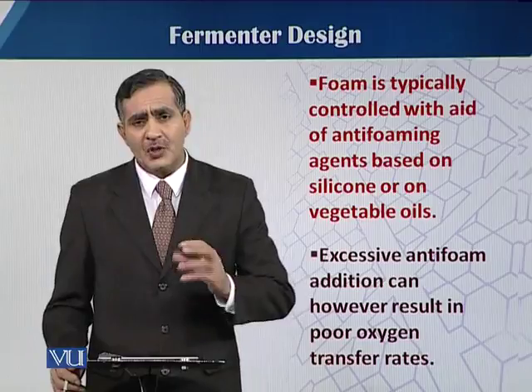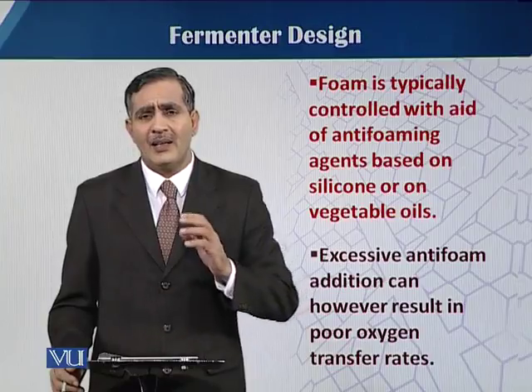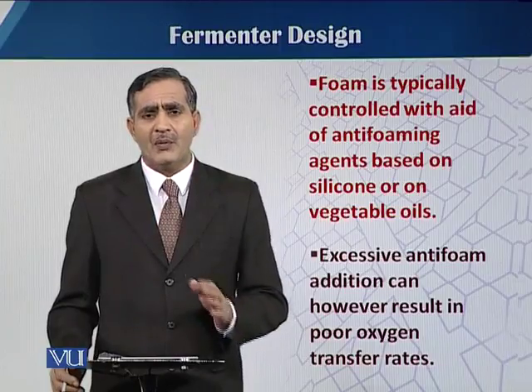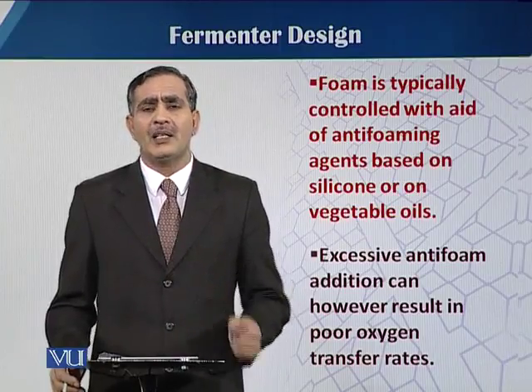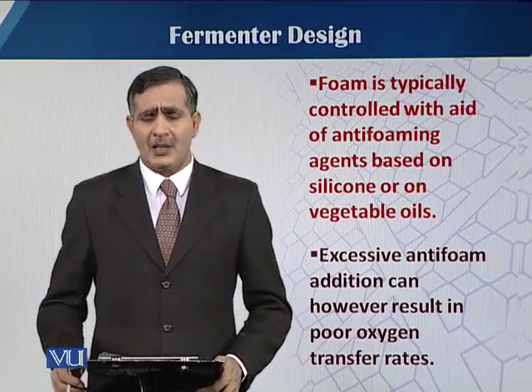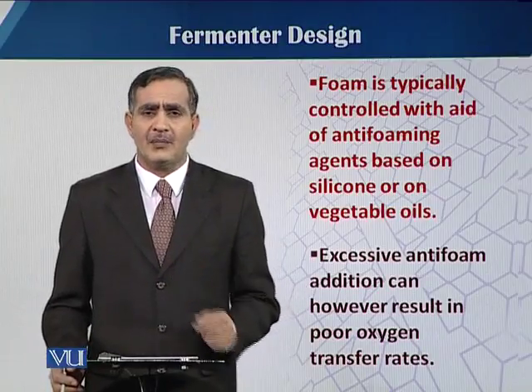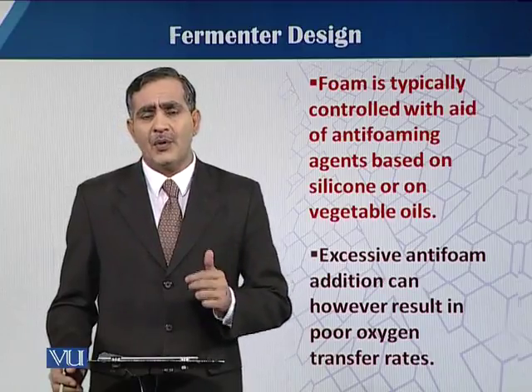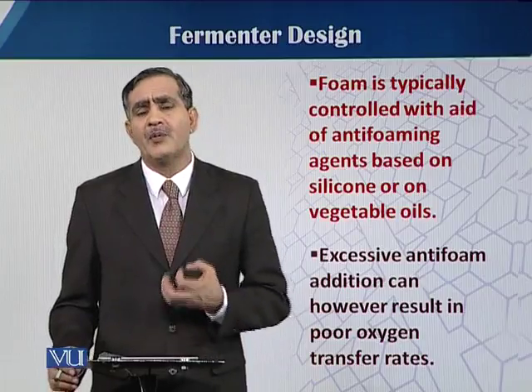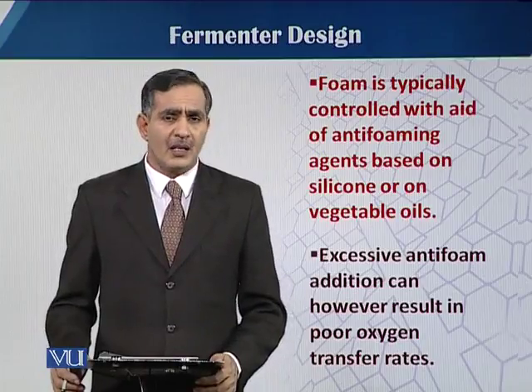If we add a suitable antifoam, the selection and choice of the antifoam is very critical. In a later module, we will talk about the qualities of antifoams, because the antifoam has to directly enter the fermentation medium. That can have a toxic effect on the organism, and antifoams can also affect the oxygen solubility. That's why we have to be very careful about selecting the antifoams, which we'll talk about in our later module.